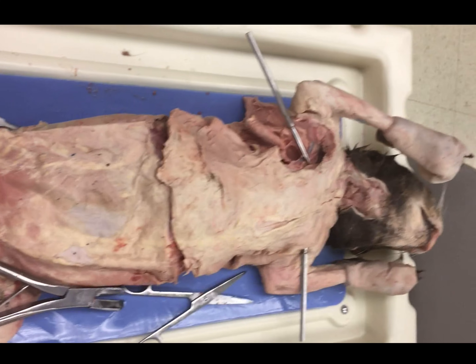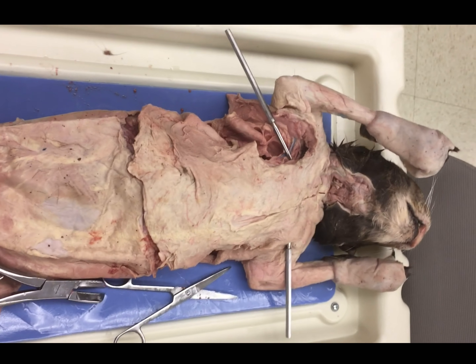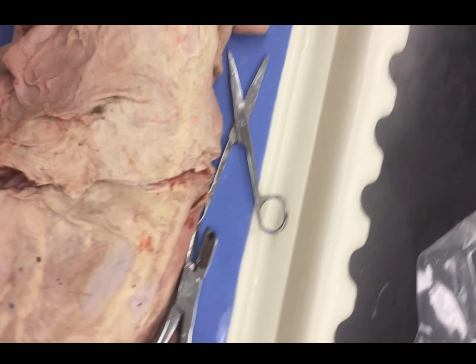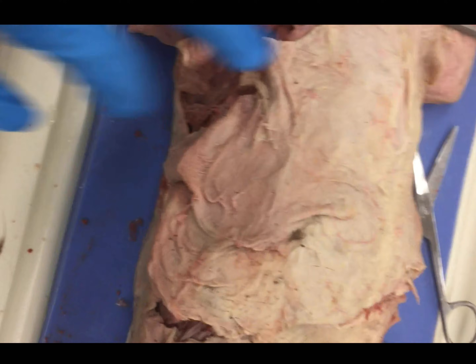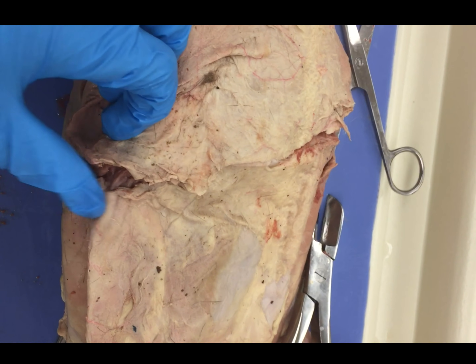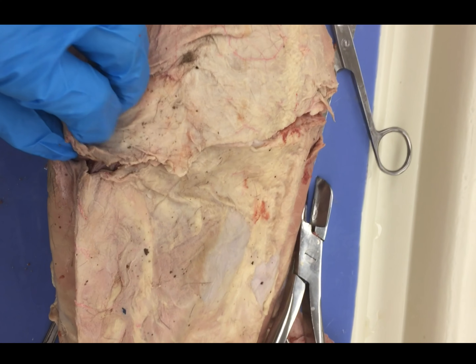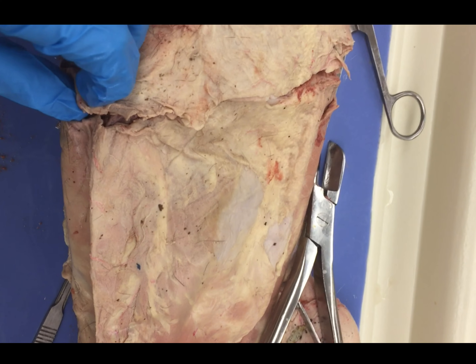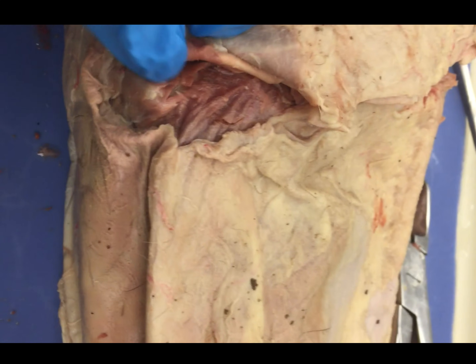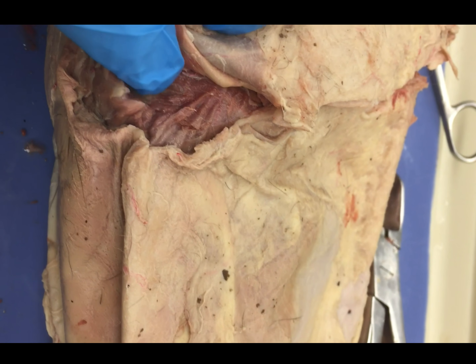So what we see here, I've kind of started our initial cat dissection. What I've done here is the first thing you guys are going to want to do is palpate down until you can kind of feel the end of your cat's ribcage. Mine's actually about here. And then what you'll do is you can take your scalpel and start to make some small incisions until you start to see tissue that looks like this.